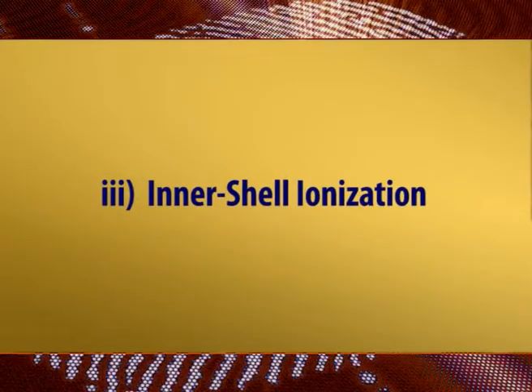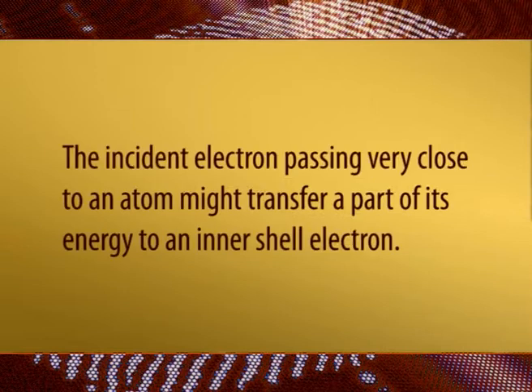Then we have inner shell ionization. The incident electron passing very close to an atom might transfer a part of its energy to an inner shell electron.